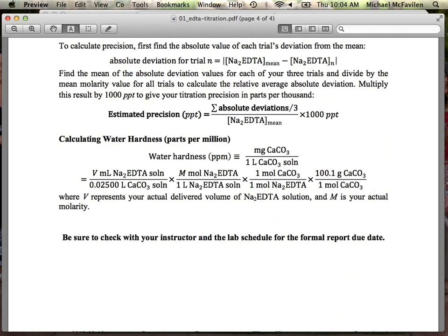It's effectively the same thing as your milligrams per liter. So as soon as you get the milligrams per liter, you can now change your unit from milligrams per liter to just parts per million. And you've got the same thing. Okay? You'll notice again the calculation is very, very similar. They added a little bit more information here to help you figure it out. Okay? V here is going to stand for the volume from what? From your tall measuring device again, right? What's this big M? That's your standardized concentration. Put brackets around it for concentration. Okay? Questions about any of that?